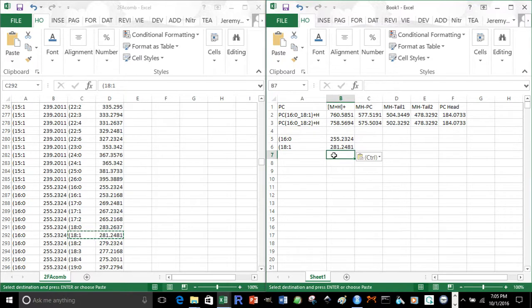Now I can do a mathematical formula, and I'll take the precursor mass minus these two fatty acyl chains, which should give me the backbone mass or something. This number, whether it's the exact backbone mass or not, is what you would add to the two fatty acid tails to get back to the precursor mass. I can show you, for example, if I added the two fatty acid masses plus that quote-unquote backbone mass, I should get back to my original ion mass to charge.